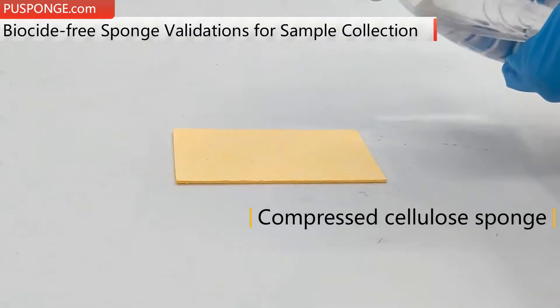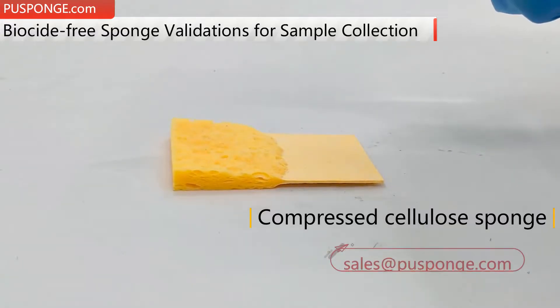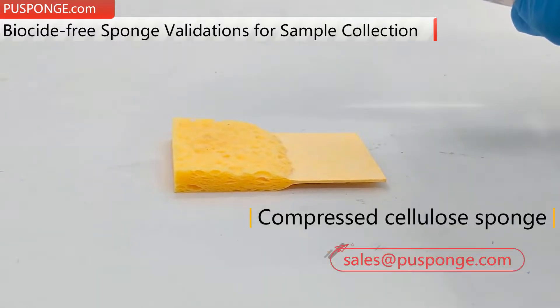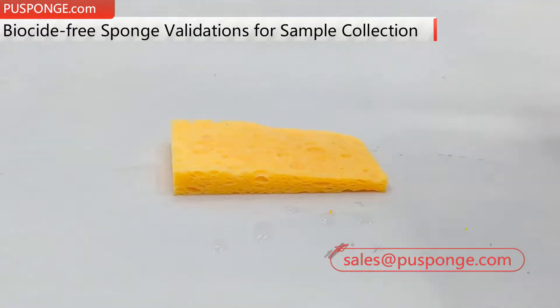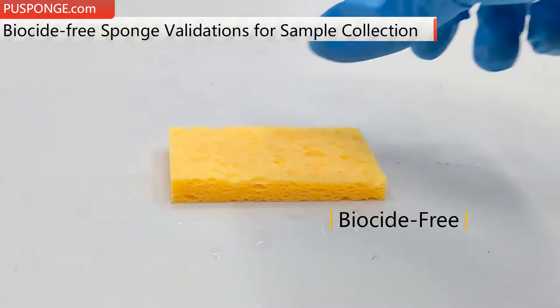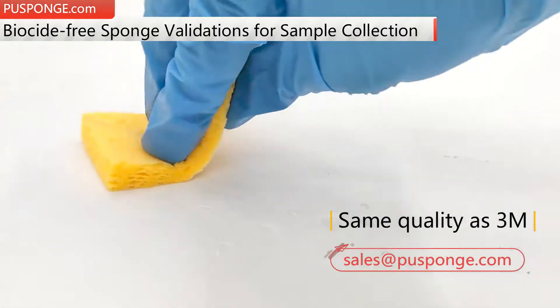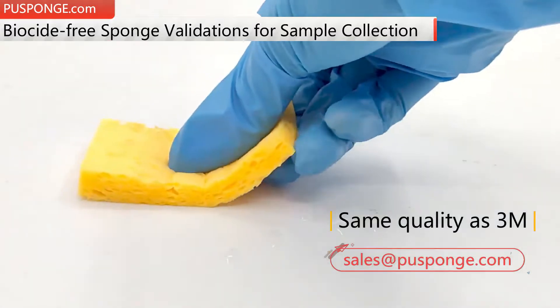Biocide-Free Cellulose Sponge Validations for Sample Collection, Preparation, and Processing — Quality Without Compromise. Better testing begins with better samples, and better samples are obtained when you use the best collection tools. Sample collection provides quality products designed specifically for microbial surface sampling.